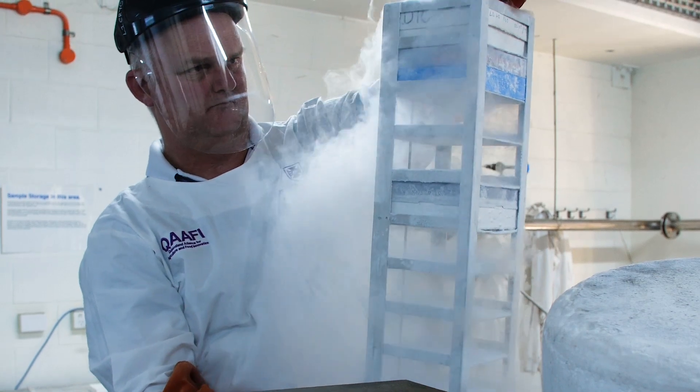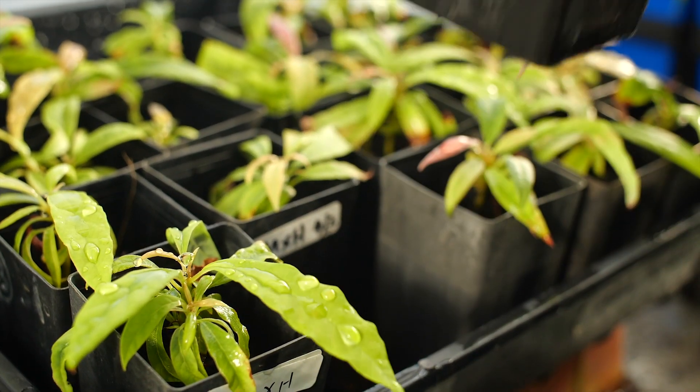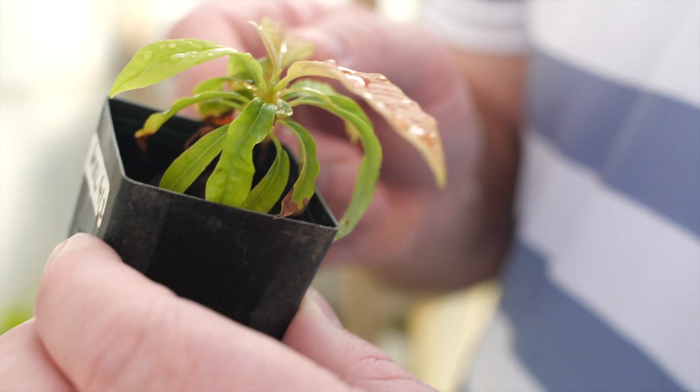I've been able to re-warm the shoot tips and then grow them on the regrowth media, and then I've been able to root the cultivar and plant them out. They're in the glasshouse now.